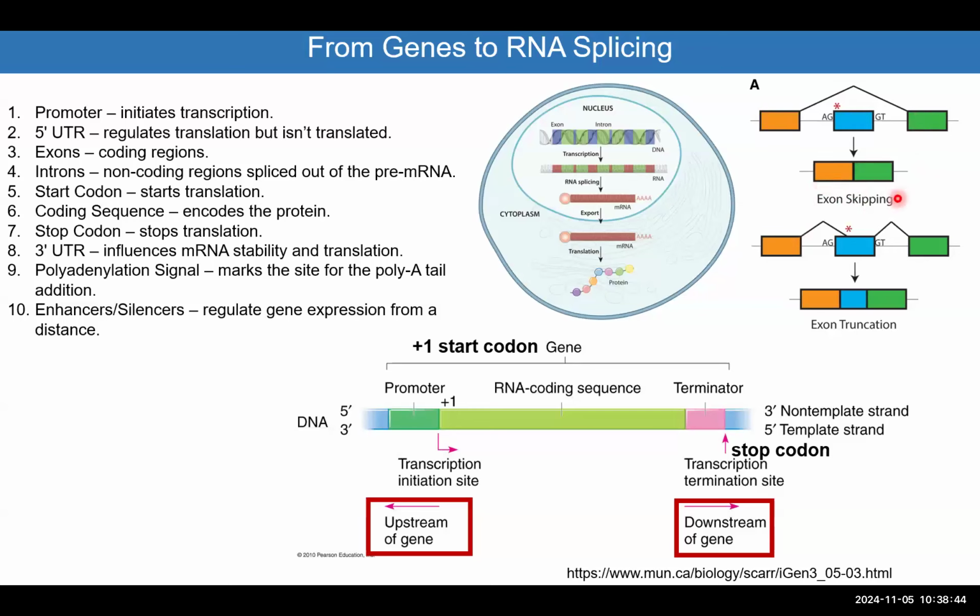So within the exon, if I have this gene in 2 different transcripts, and I want to differentiate if it's, for example, in normal cells versus cancer cells, which isoform is expressed more, I have to design primers that are specific between exon 3 and exon 1 on one side, compared to exon 1 and exon 2, or exon 2 and exon 3 on another side.